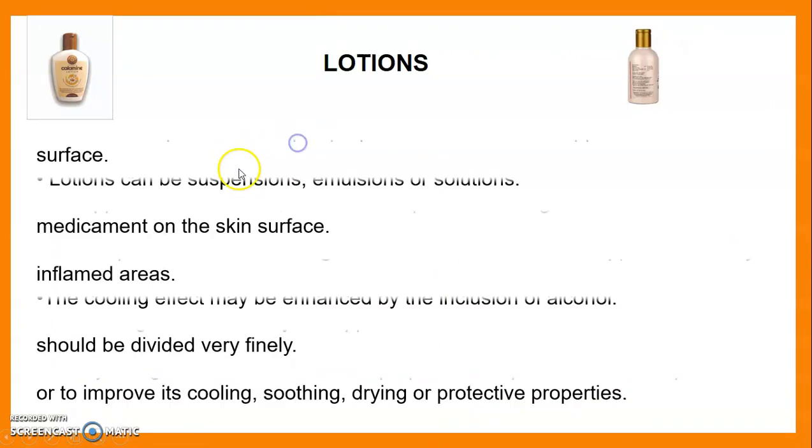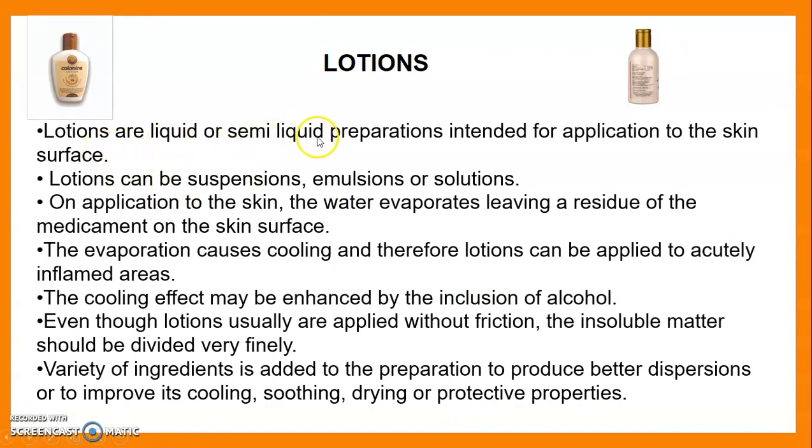Then we see the lotions. Lotions are liquid or semi-liquid preparations intended for application to the skin surface. Lotions can be suspensions, emulsions or solutions. On application to the skin, the water evaporates, leaving a residue of the medicament on the skin surface. The evaporation causes cooling, and therefore lotion can be applied to acutely inflamed areas.